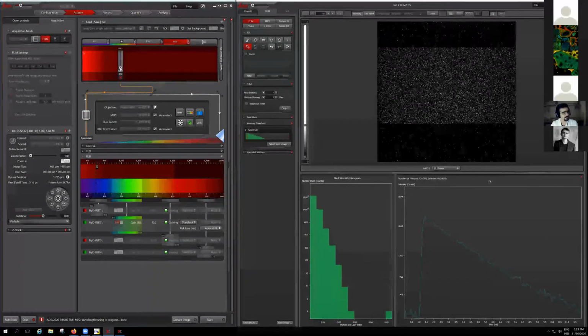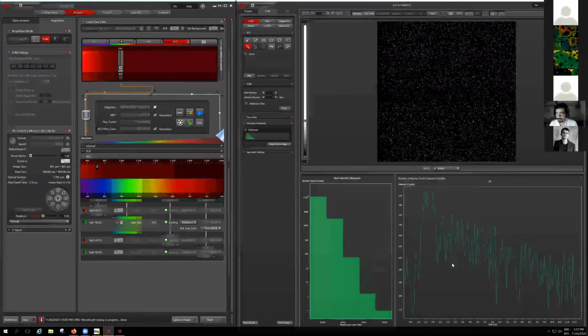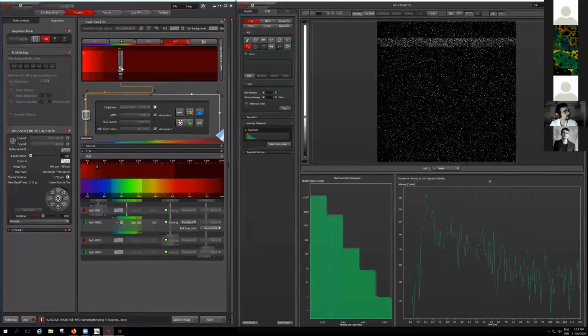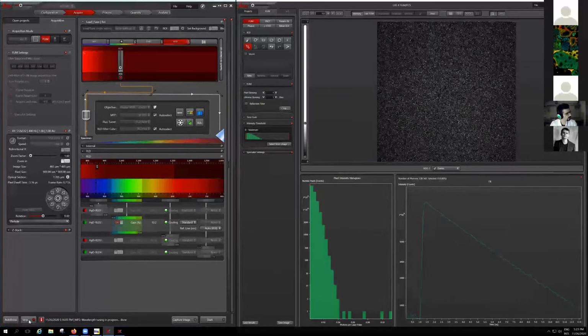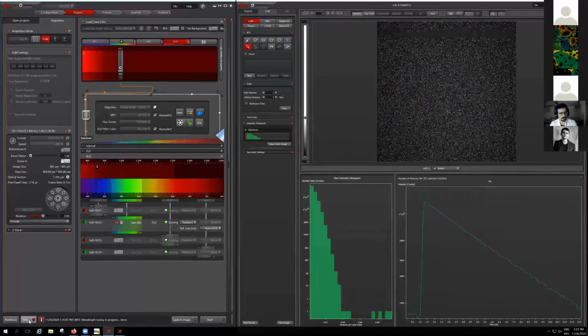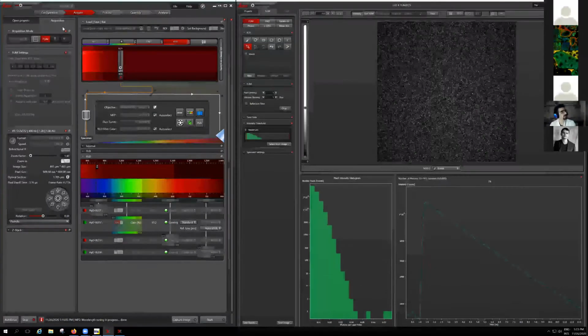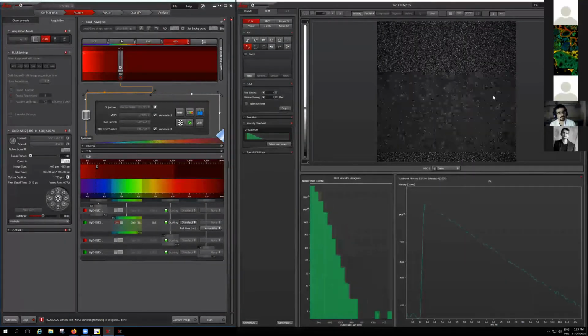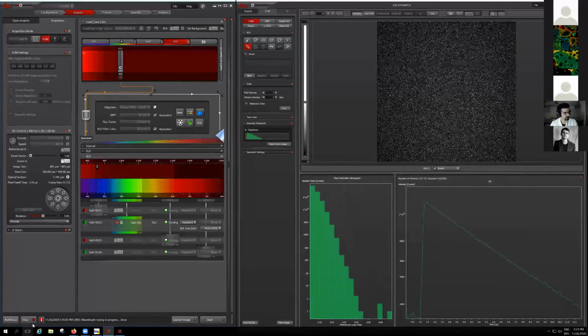It wasn't really much different, between that and what we are going to acquire at the end, NADH or FAD. So I can maybe increase it, something like 7-10% on bleaching, but I don't think so. Or maybe it seems actually the signal drops down when I was at the high, but in the solution I didn't expect to see that super fast.